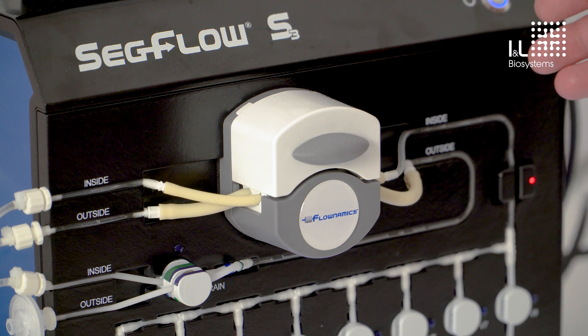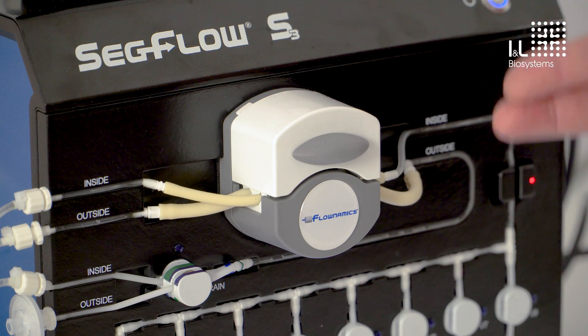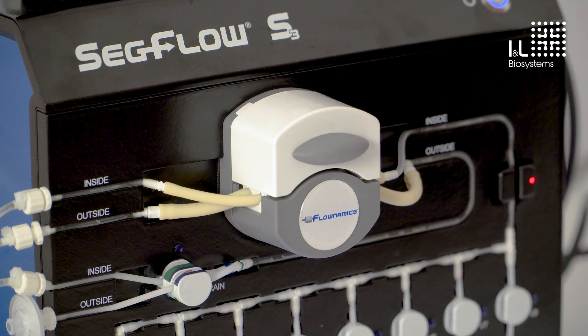It continues to run to this peristaltic pump and then further on to the sampler. The peristaltic pump is an important central element because it builds up the suction through which the liquid is transported. It can run faster or slower and it has six rollers, which means always three rollers on the tube, ensuring a uniform flow in the system.